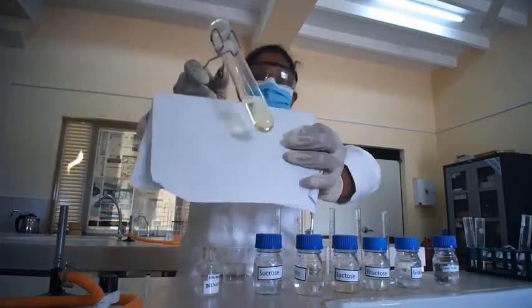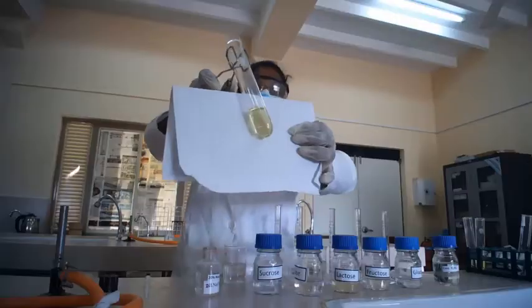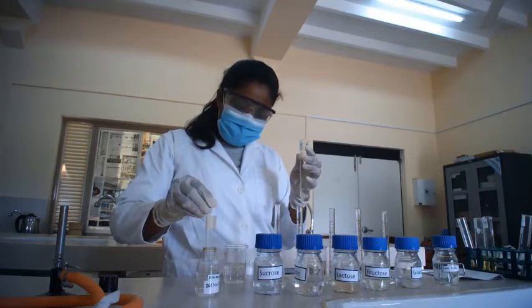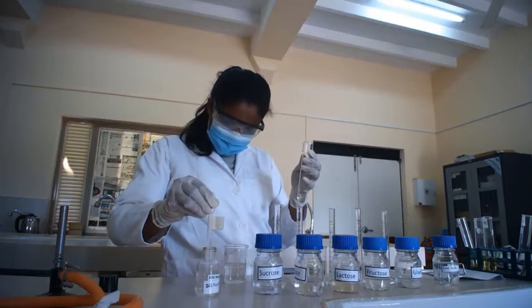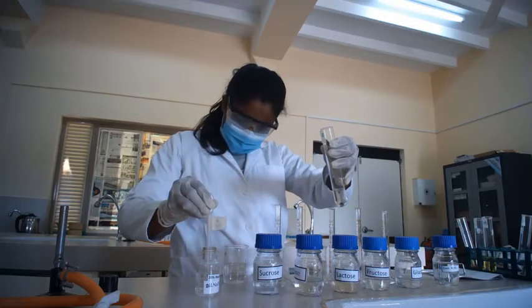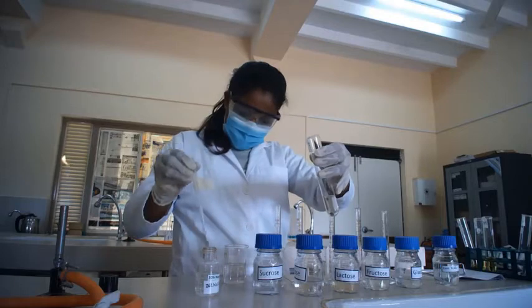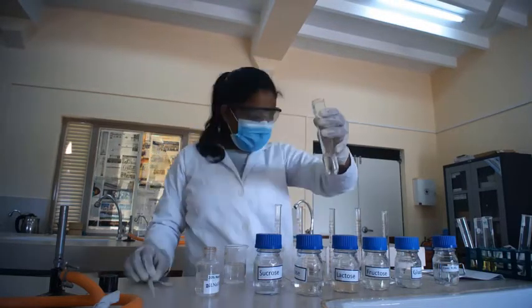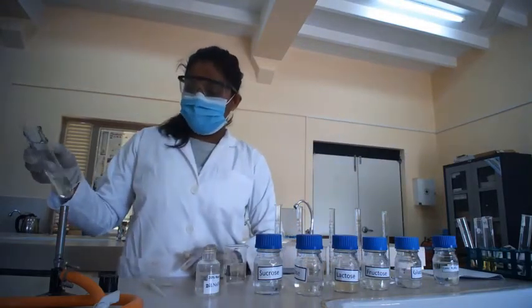Now you can see the color change from colorless to yellowish. We are going to add the same amount of sodium hydroxide into the fructose solution, and boil in the Bunsen burner and observe the color change.